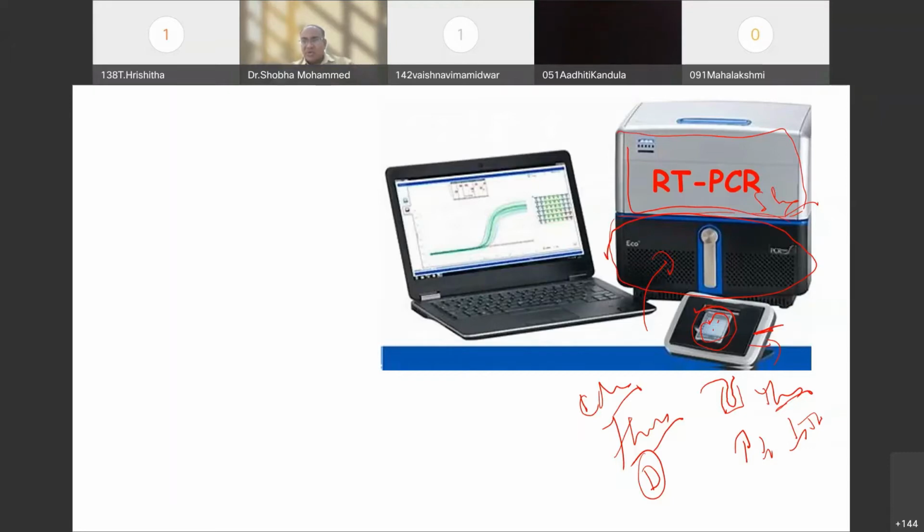So the spectrophotometer assembled here allows us to plot graphs against the concentration of the fluorospectroscopic dyes. The dyes present allow us to plot this type of graph, which tells me about the concentration of that particular antigen. Whatever I'm looking for, either DNA or mRNA, the concentration will be plotted on the screen of the system attached here.